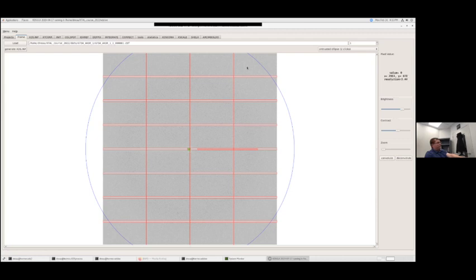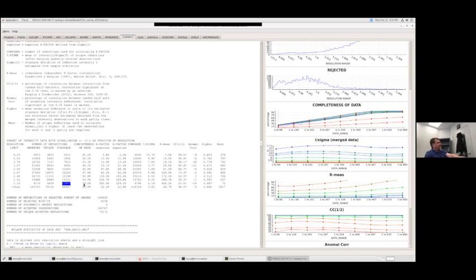Okay, so you're only getting those highest resolution reflections in these little sections in the corner. And so even if I had diffraction that extends out to 2.18, I would most likely see that completeness of the data set is relatively low compared to other shells. So this is the completeness of the data set for each shell in this column here.